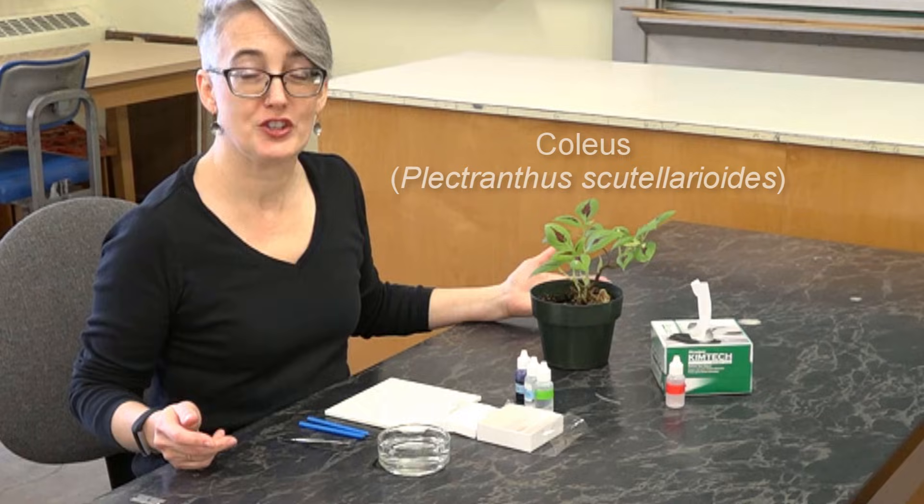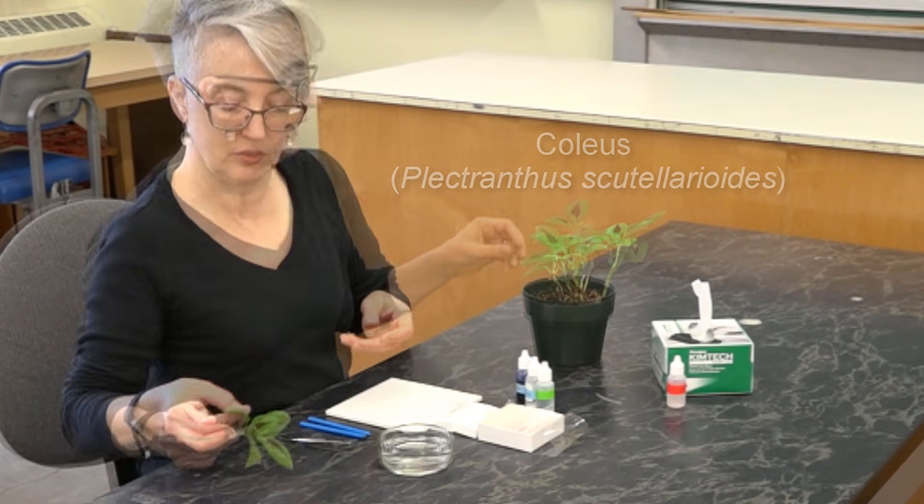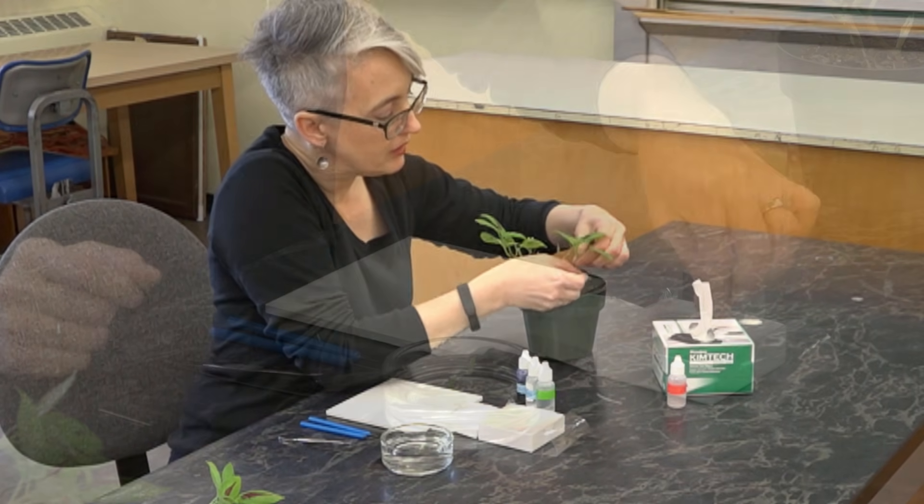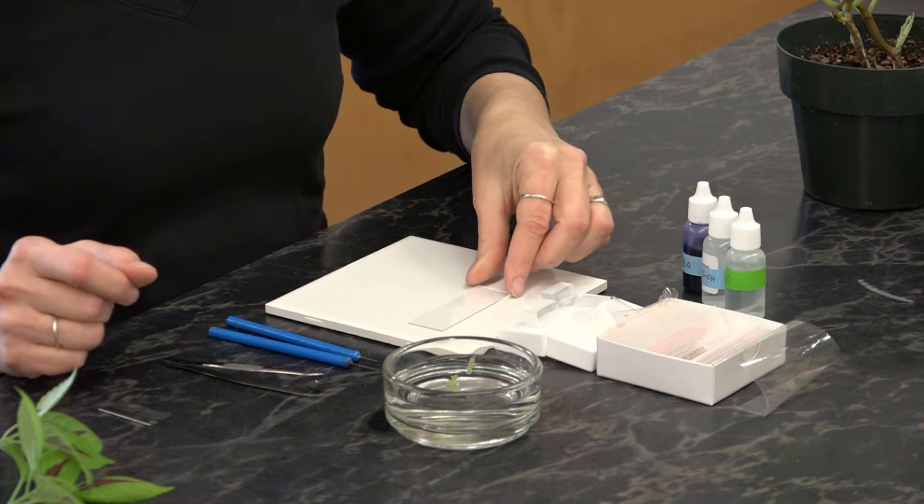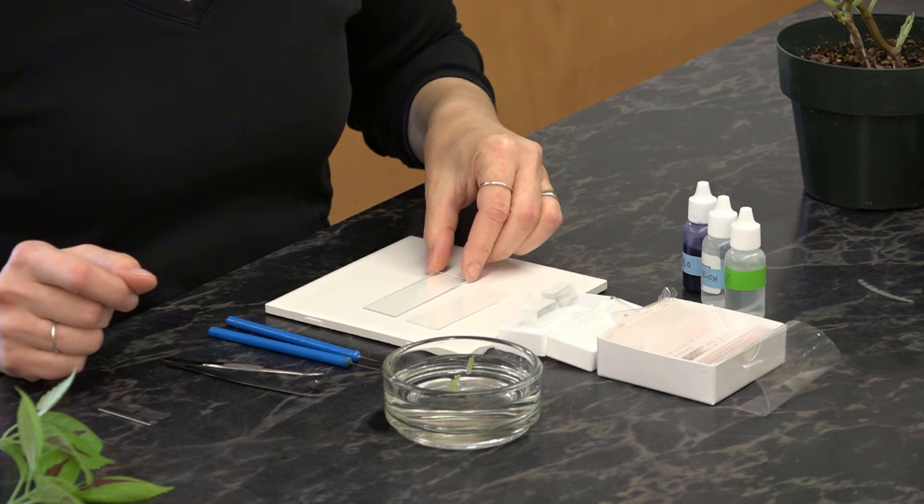For this demonstration of hand sectioning, I'm going to use the coleus plant. First I'm going to harvest some stem sections here. You'll always want to begin by having your slides ready and waiting.